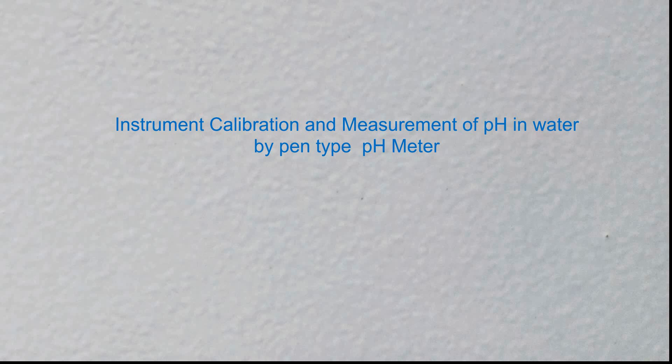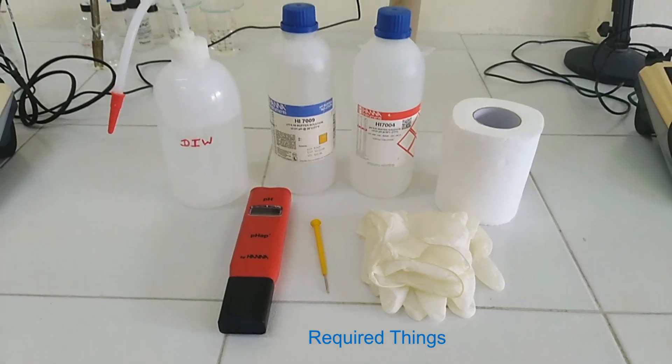This video includes instrument calibration and measurement of pH in water by pen type pH meter. For this, we need pH meter.